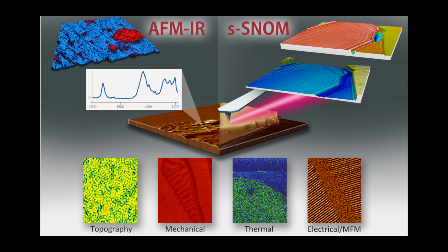Water vapor in the air absorbs within this region of the mid-IR, and so you get better spectra, better measurements if the system is purged using either dry air or dry nitrogen. Because it is enclosed, you could exchange that gas with something else and perform measurements as long as the gas is inert, not a hazardous gas or things like that.